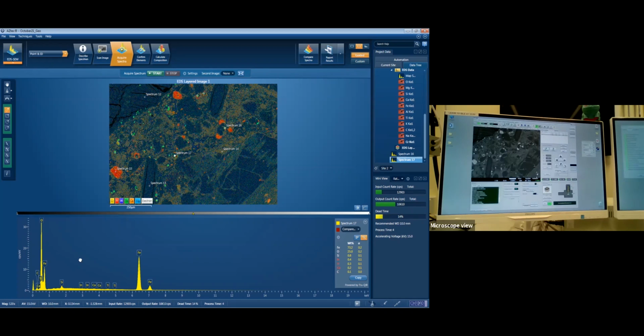So the energies that are released when we analyze a sample, they come in different wavelengths. Sometimes the software gets a bit confused. So calcium has an energy of 3.6. Indium has one of 3.2. So it's probably just getting a little bit confused, and it's doing its best. But you do sometimes still need somebody on hand to tell it actually what it's looking at, which is nice. It means we're not completely automated out of a job yet. We're still useful.